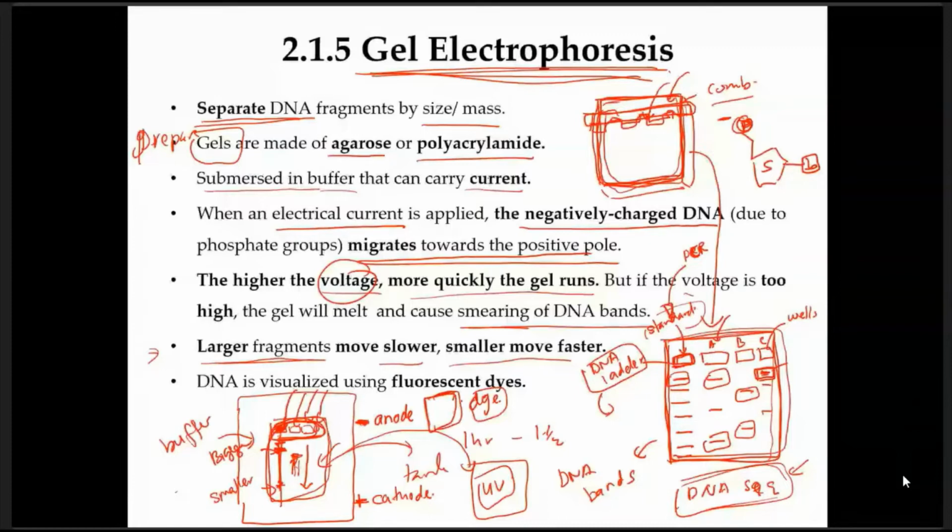Okay, so this work is sangat rumit lah kan, sangat fragile. You are dealing with sample that you cannot see, kan. So you have to dye using ethidium bromide that is carcinogen, so you have to handle very carefully before you observe under the UV light, so that you can observe through the monitor. Kat sini ada monitor.